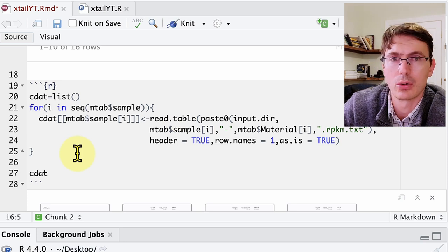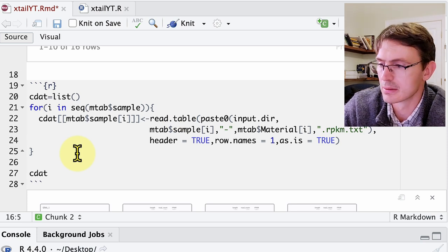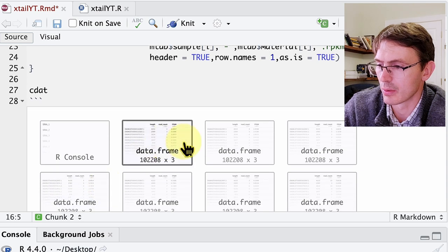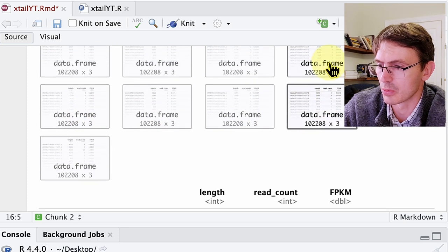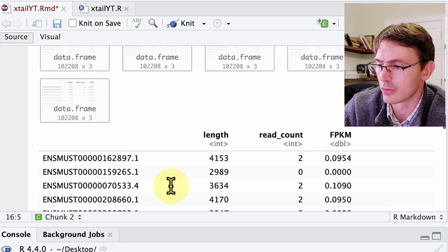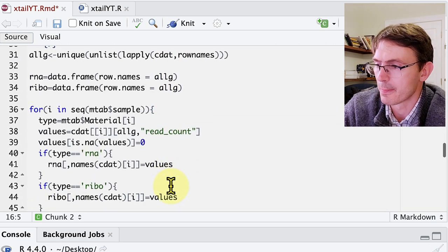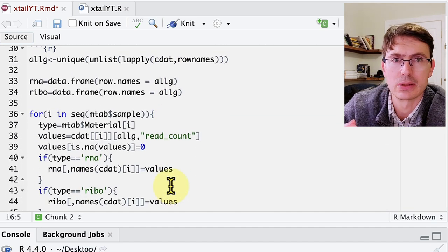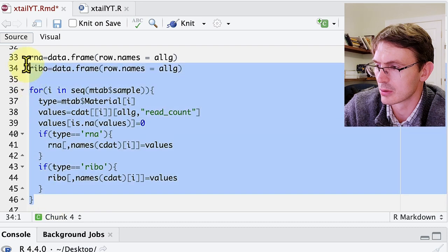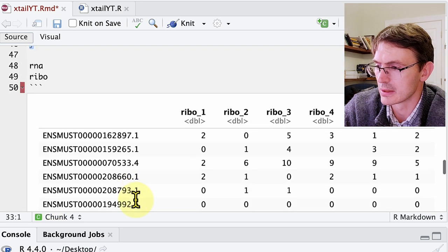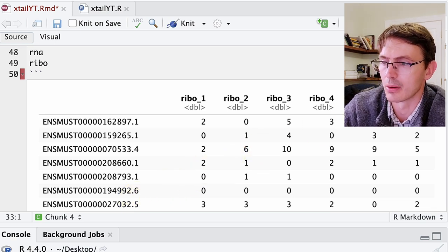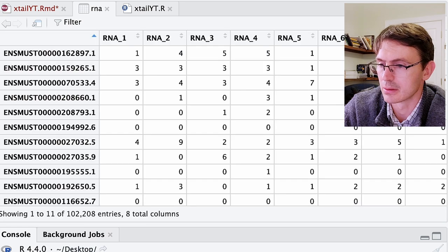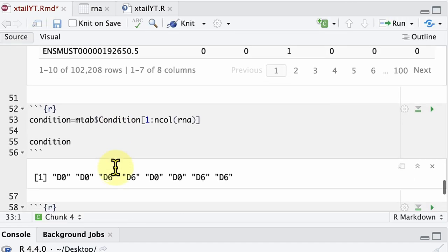The second step in the pipeline is to upload into a list all of the read count files. We end up with a list where we have all the read counts for all the different conditions — we use the metadata to do this. Finally, we create count matrices: one for the RNA samples and one for the ribosome footprint samples. This gives us either the count matrix for the ribosome footprints or the count matrix for the RNA.